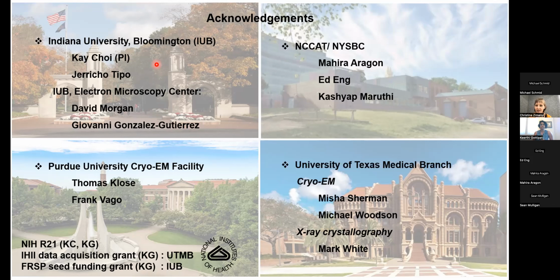And then in 3D, what really helped was, instead of 3D classifying, going back to ab initio and then redoing the ab initio models with 2 classes, 3 classes, 4 classes, that eliminated most of the bad volumes, so to speak, while cleaning up the particles.